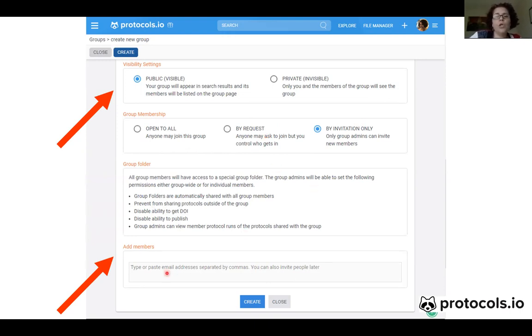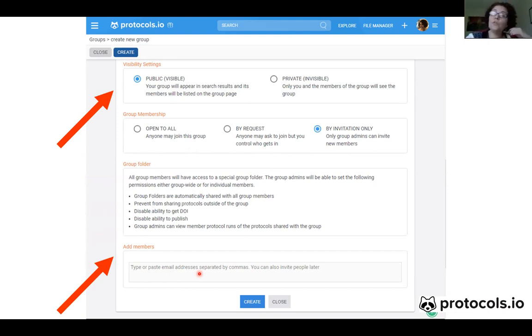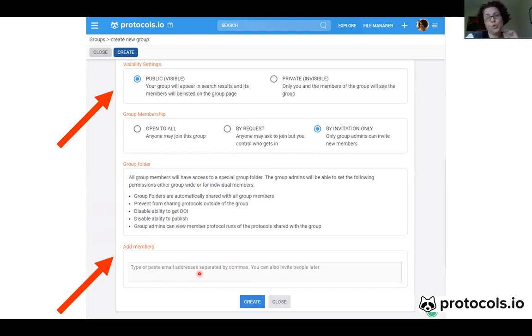You can invite people using their email address, and you can do it right away as you are creating the group, but this can also be done later. You can send an email with an invitation, or if you don't have the email of that person, there's also a link that you can share through Slack, for example, and then people will be able to join your group through that link.